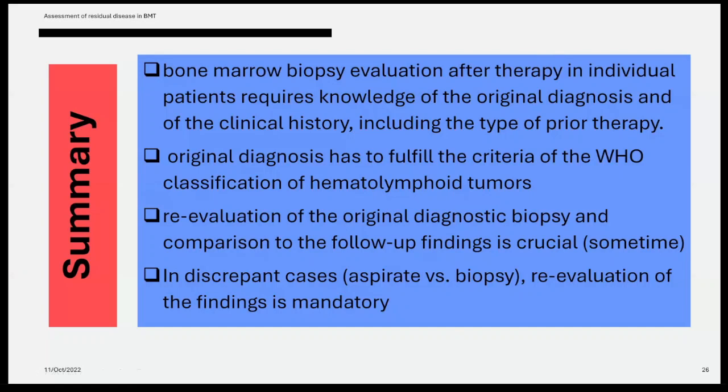This is from Dr. Zamri, who has a few questions. The first question: which maturation stage in the monocytic lineage picks up CD163? The second question: is a cluster that has more than 5 blasts considered a residual leukemic blast and not hematogones? And the third question: which type of CD68 is the best to stain the monocytic lineage? Is it KP1 or PGM1?